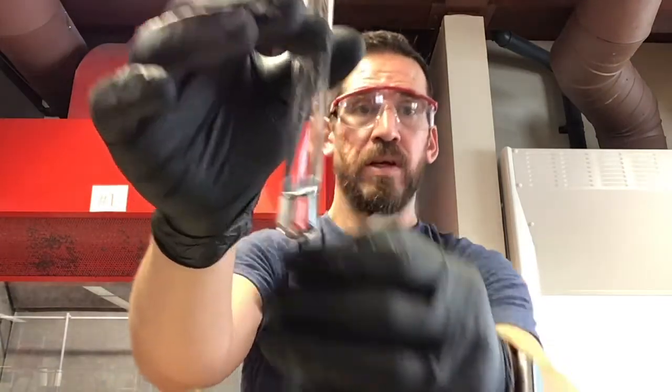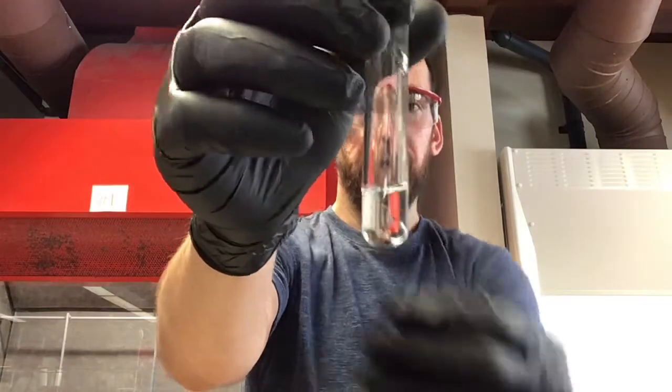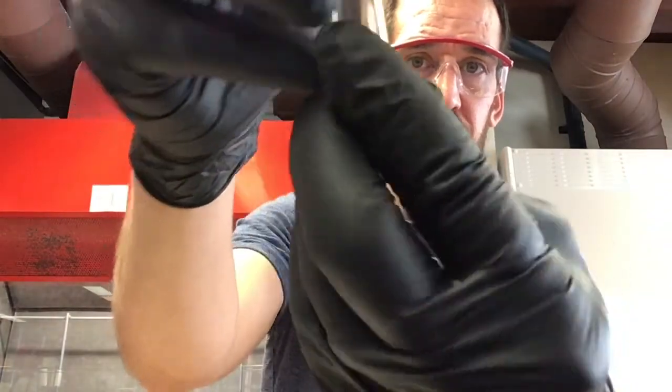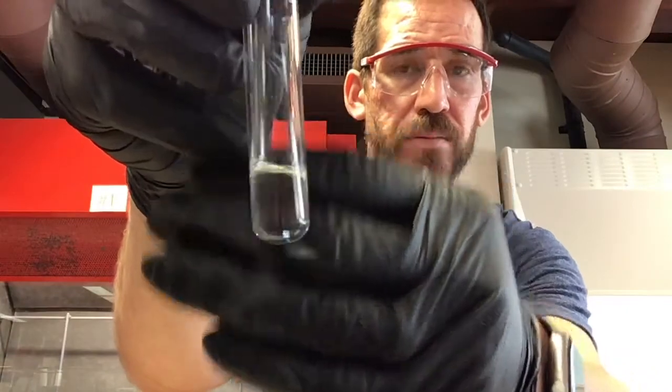Okay, so far this is 2-chlorobutane, and I'm just going to tell you, I personally do not observe a color change. Okay, so set that one aside for now.